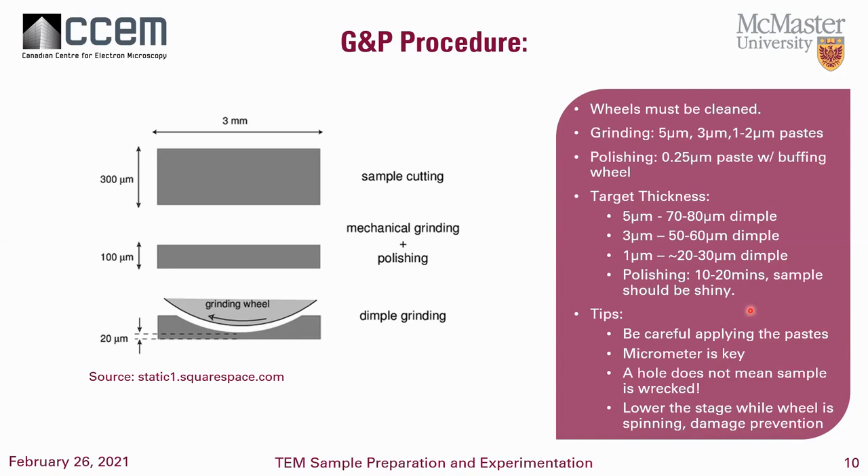A hole does not mean the sample is wrecked. If you accidentally made a hole through your sample at around one micron, take that sample, look at it under a light microscope, and judge how big the hole is. If it's maybe around 50 to 100 microns, you can do a low-angle mill to make that hole a little bit larger, target the outside boundaries, put it on the TEM, and see if you can get an area out of it. Not every sample should be thrown away after making a mistake. Also, make sure you lower the stage while the wheel is spinning to avoid that extra frictional force.